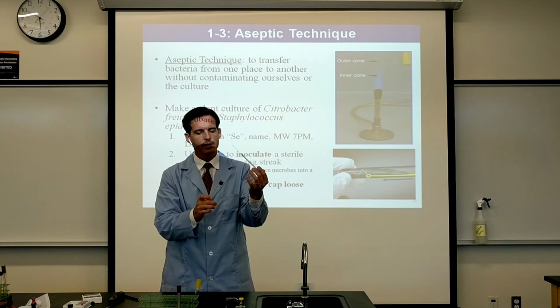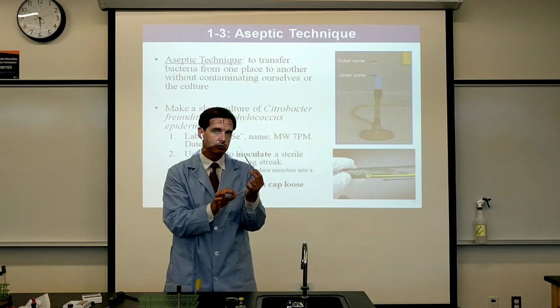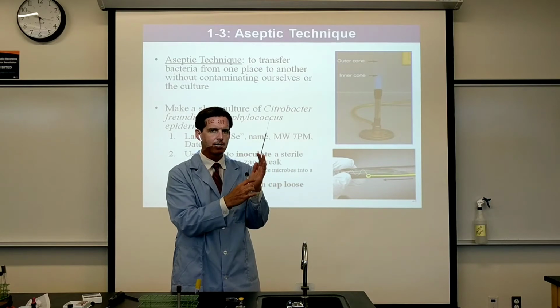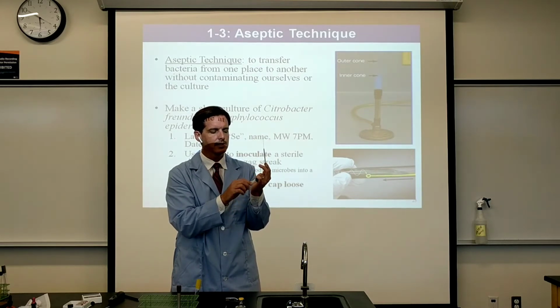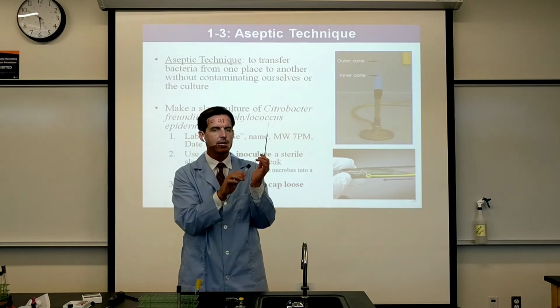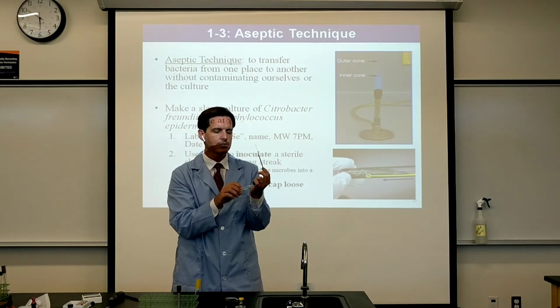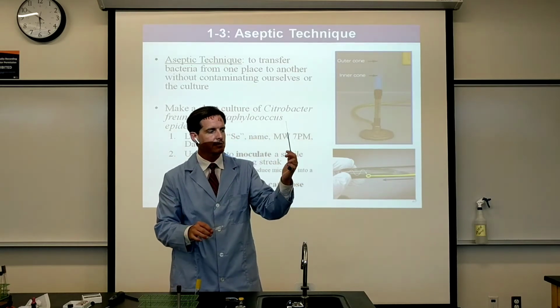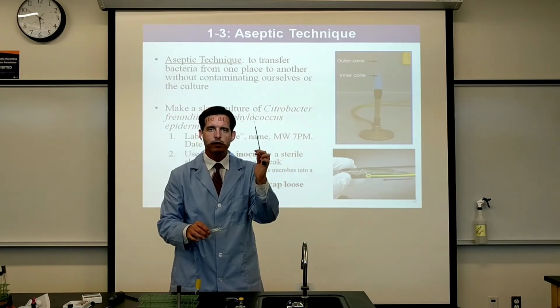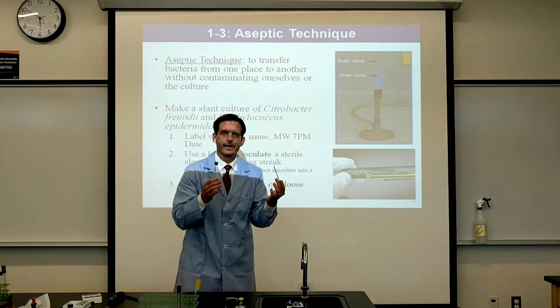And when we go to do that, we now have such a small cap that if you try to wrap your pinky around it, there may be some issues. First of all, we don't want to have the bottom edge of the palm of your hand, that skin. You don't want your skin wrapping around and touching the bottom edge of the cap. So rather than doing the pinky wrap, which, if you have tiny, small fingers, you could do, this would probably give me arthritis, my finger cramping up very quickly if I did that all the time. So I want to show you guys a different way to do that.